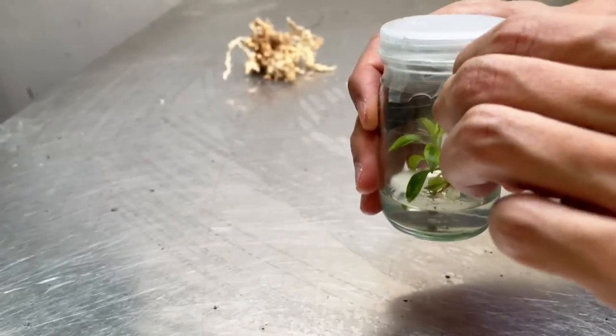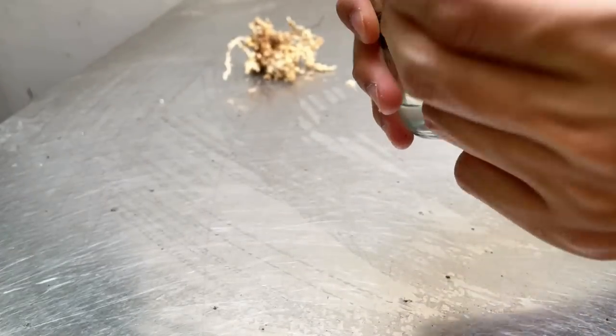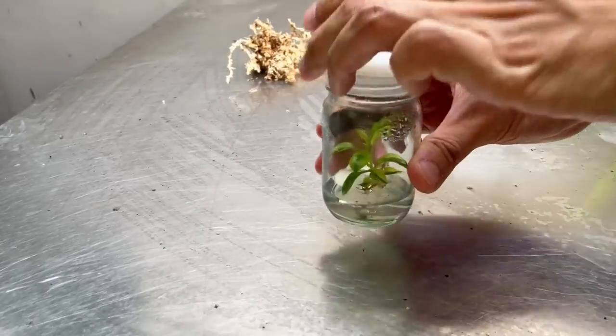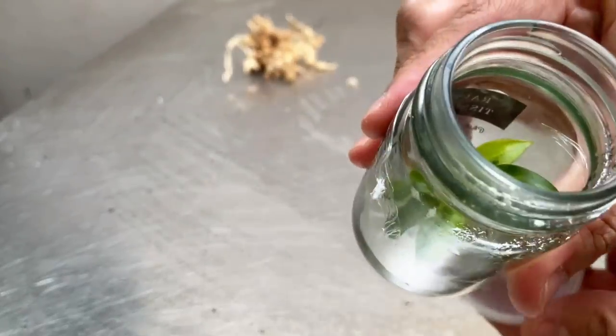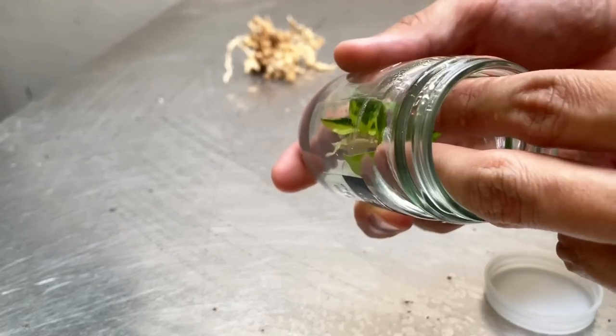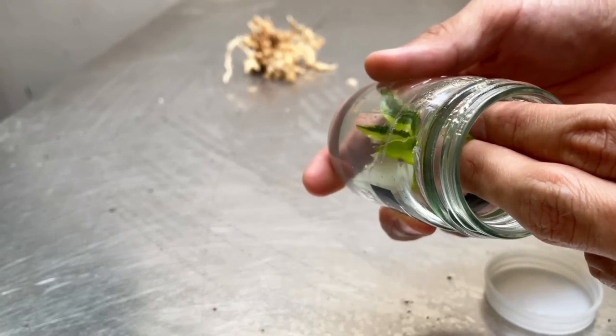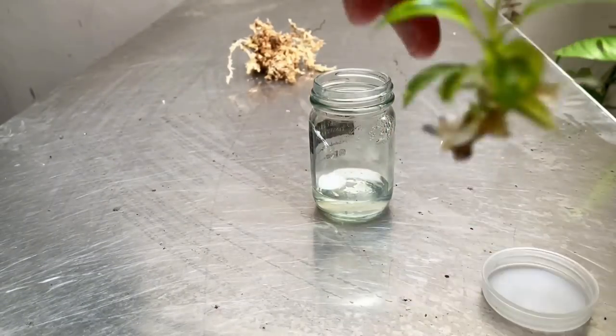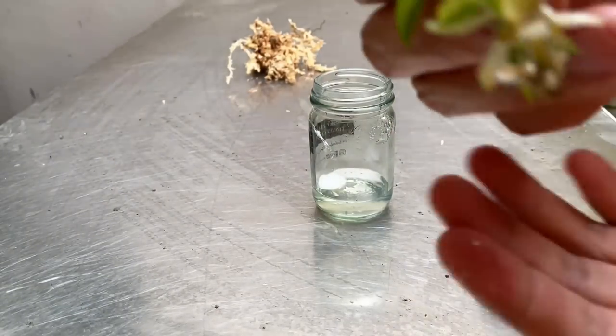I'm going to take this off, releasing it from its sterile environment. Let me take it out — it'll be a lot easier with a pincer, but let me try with my fingers.